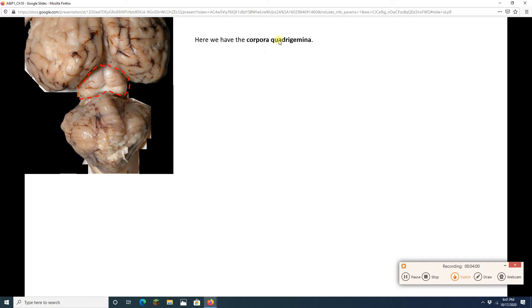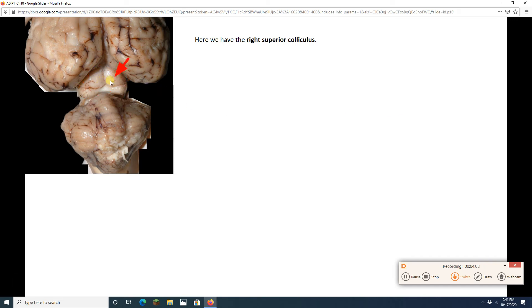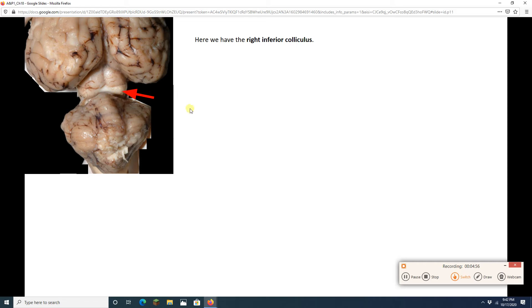Four bodies, four twin bodies — corpora quadrigemina. The top two are the superior colliculi. The two superior colliculi are involved in visual reflexes, like coordinating eye movement with head and hand movement. We also have inferior colliculi. Inferior colliculi are very much involved in the startle reflex — when you turn towards a loud noise, for example. These inferior ones are really big, and the superior ones are really small. Think about which sense is probably more important to a young sheep.